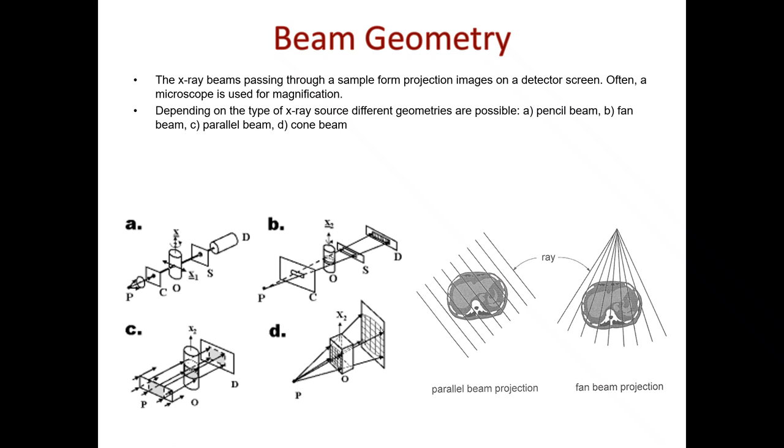And I have to maintain a constant density across this, which is not necessarily easy, right? With respect to the size of what I'm imaging with. So then I'm passing through, and here I'm reacting with a detector, and this is where the image is formed, okay? Because I have something that is sensitive to those beams and creates an image. And then I rotate, and from a different direction, I get a different image. Right? Now, I basically impose a grid on top of this.